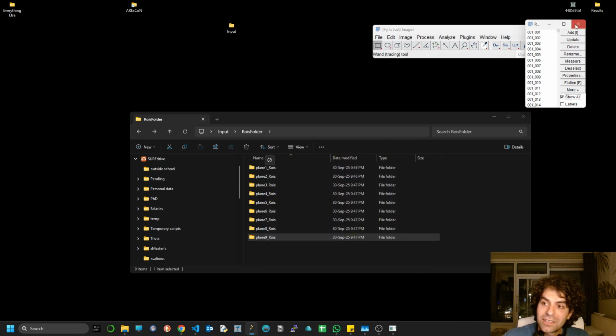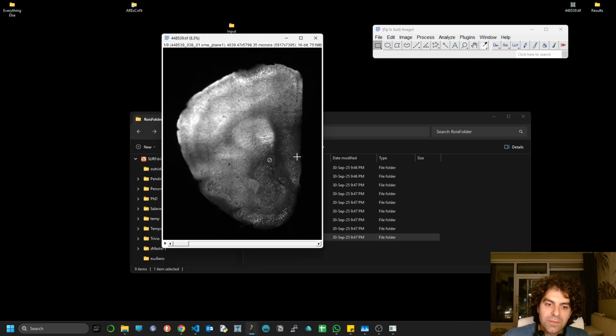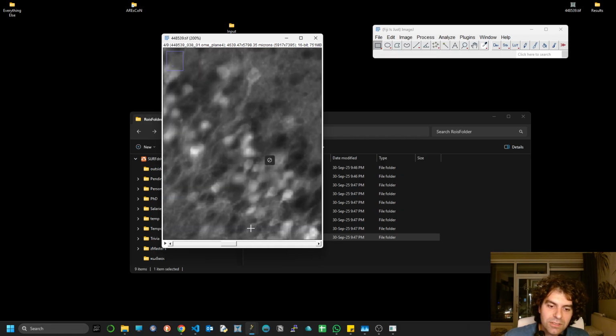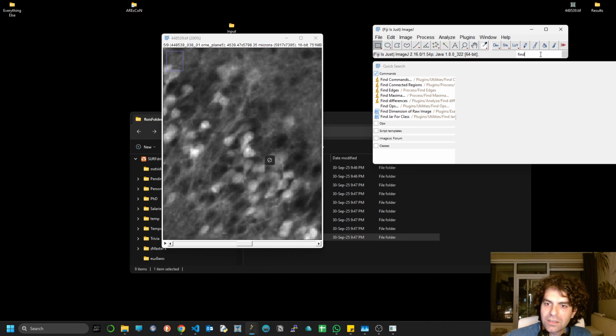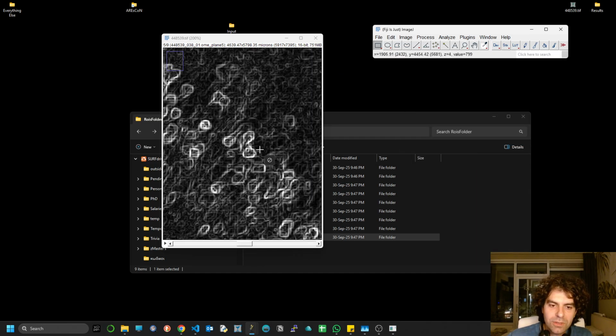And what the find edges is, we can also have a look at that, is a way, a Laplacian equation that separates, in a sense, the contours. It doesn't know that it's the contours exactly, but I don't know the details, it can understand the difference in the contrast, and it can accentuate things that are potentially contours. So if I do find edges, let's do this for this one, right?